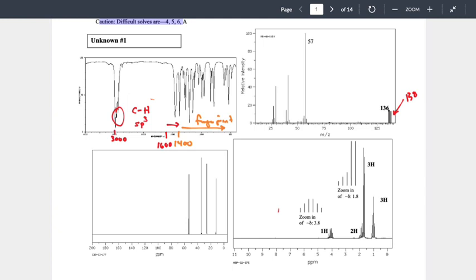So we've got a molecular weight, which we'll come back to and use. We know about bromine, we know about chlorine, we know it's a negative for chlorine. There's 2 more elements that we should be thinking about when we look at mass spec. Nitrogen has an odd bonding pattern. In its bonding pattern, it's going to generate an odd molecular weight, assuming there's an odd number of nitrogens. So if we look at our molecular ion peak at 136, that's even. That would suggest I don't have an odd number of nitrogens.